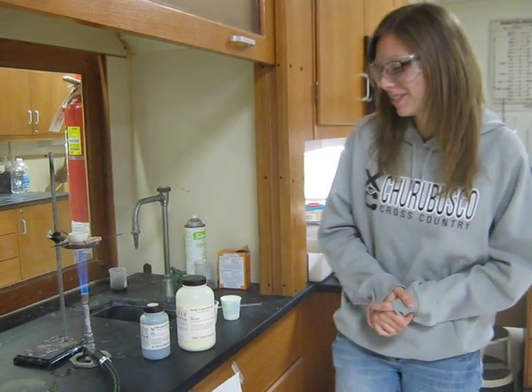Hi, I'm Alex Iyer, and I'm going to be doing the Zinc and Sulfur Lab.